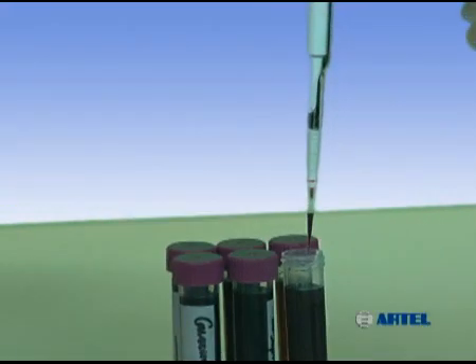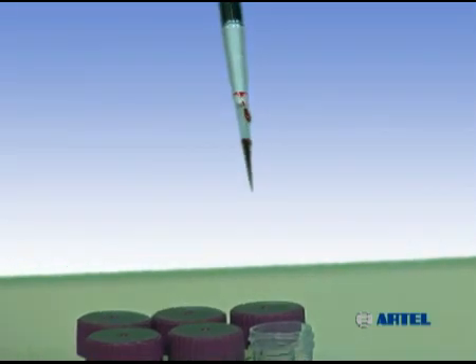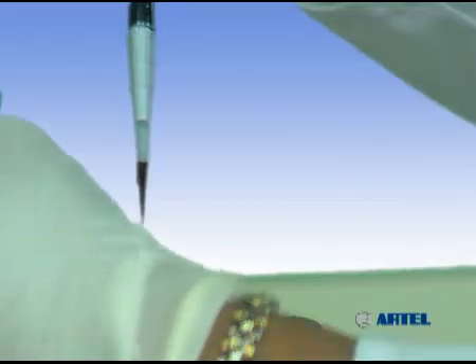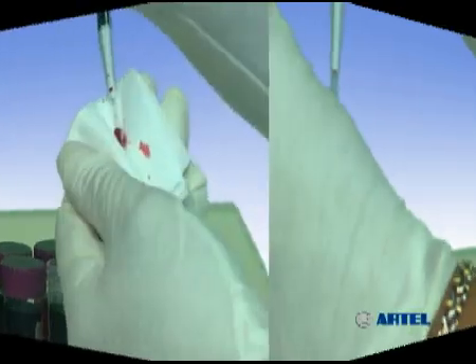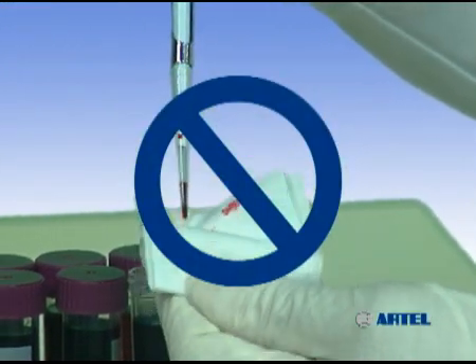After aspirating a liquid, droplets can sometimes be seen on the outside of the pipet tip. In this case, it may be appropriate to carefully dab the droplets with a lint-free cloth. If you decide to remove the extra droplets from the tip exterior, it's important to stay clear of the tip opening. Additionally, avoid a full tip wipe because this could cause sample loss due to wicking out of the tip.